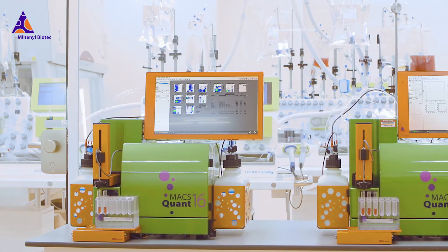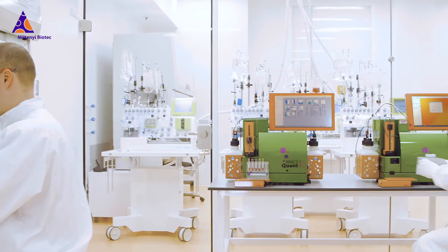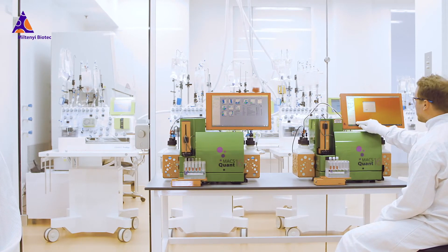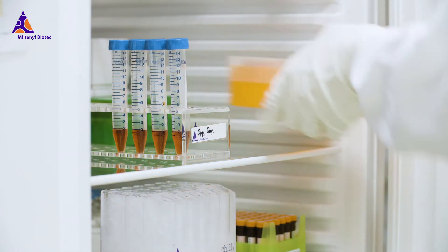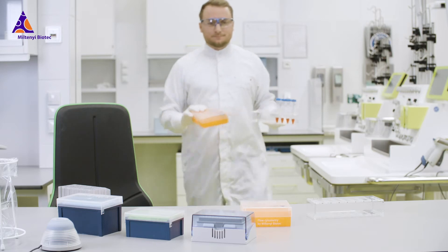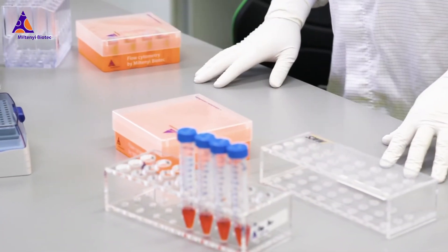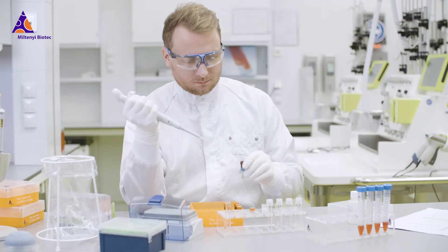Reliable manufacture of cellular products is often a complex operation with huge responsibility. Therefore, accurate flow cytometric in-process and quality control steps are indispensable. However, manually mixing antibody cocktails makes standardization very challenging. Even tiny pipetting differences can affect accuracy and consistency of the control steps.